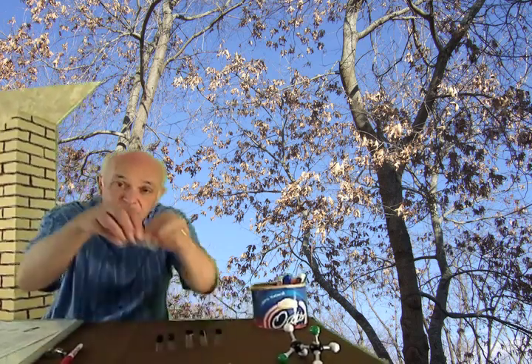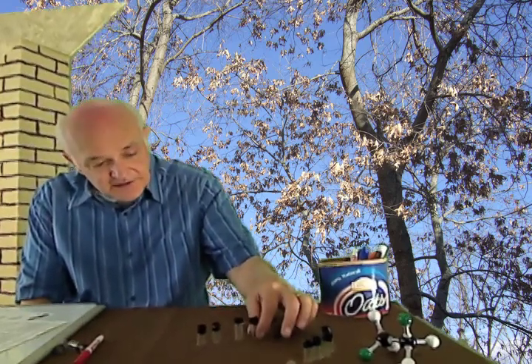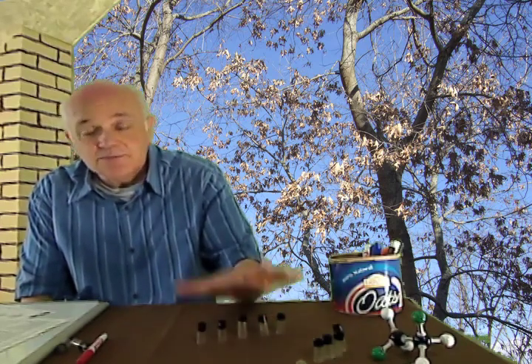We cap these off real good, store them away somewhere where they're safe. They're expensive. And we have our 20, our 50, our 80, our 120, and our 160. These are all nicely labeled. They go in our control log, incidentally, for the EPA. But we're not quite done with them, are we?